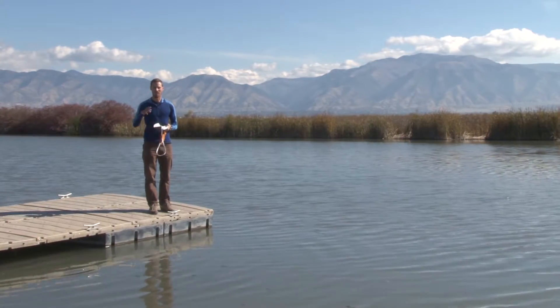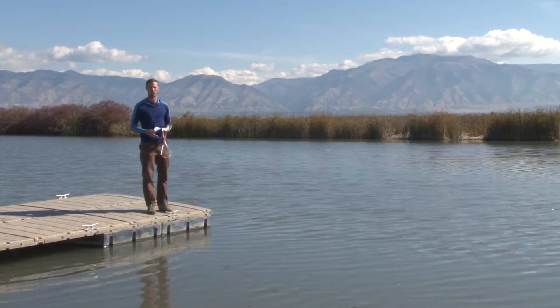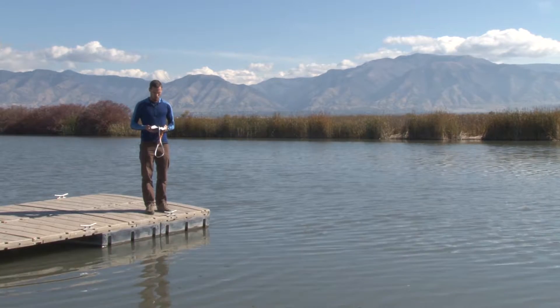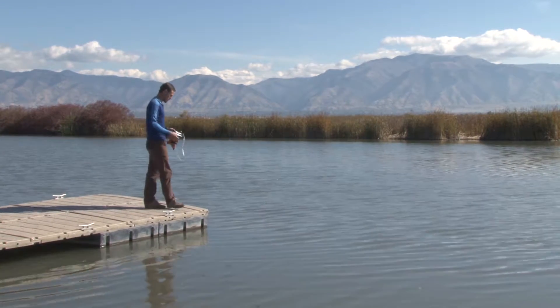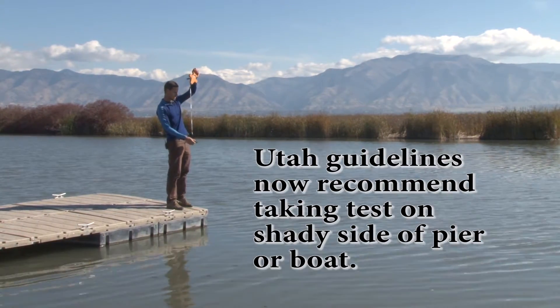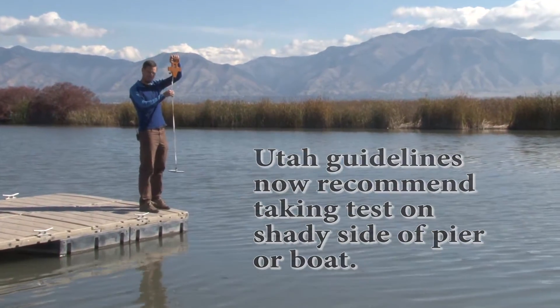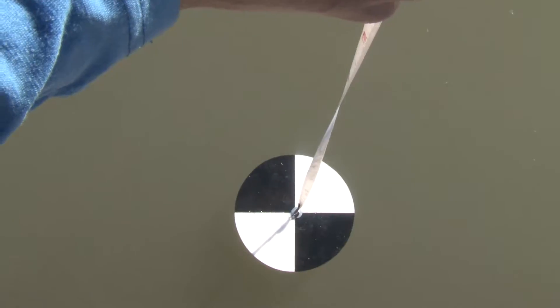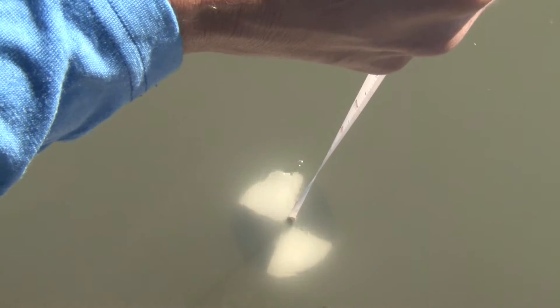It's important to remember not to be wearing polarized glasses because those help you see further down into the water. How you do this test is you come out to your monitoring location, take the disk which is attached to a measuring tape either in meters or in feet, and slowly lower it down in the water until you can't see any of the white and black markings.